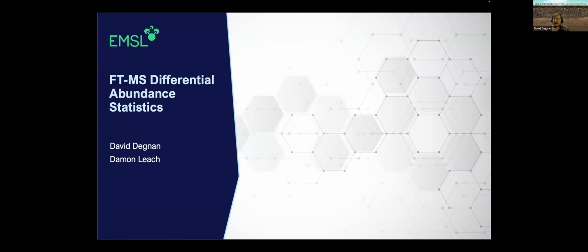Usually when we think about differential abundance as biostatisticians, we're addressing specific omics, and as you've noticed, FTMS is a very special kind of data. So here we're going to demonstrate how the differential abundance pipeline can be helpful to answer specific questions and get more conversation started on what we can do to push the FTMS field forward, what's appropriate for it, what's not, and what we can use that we've already done in other fields. All of that I am very excited to talk to you about and would love some conversation about it in the Discord channel and as we meet later.